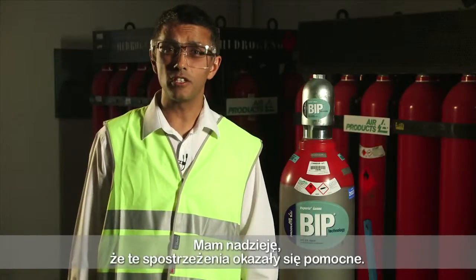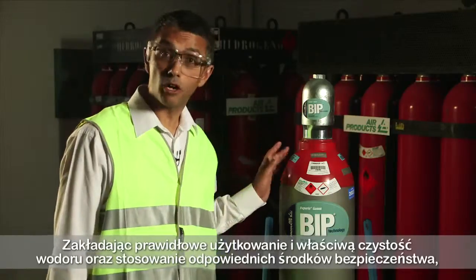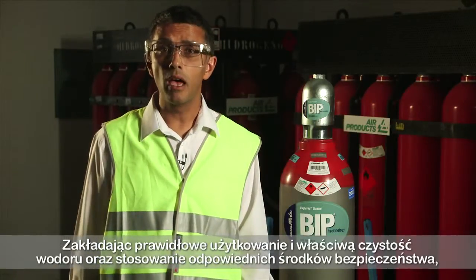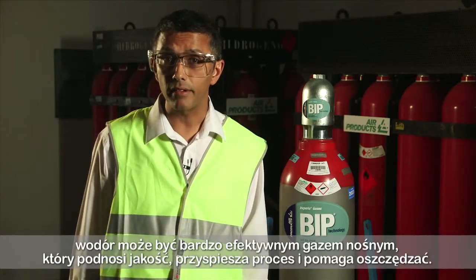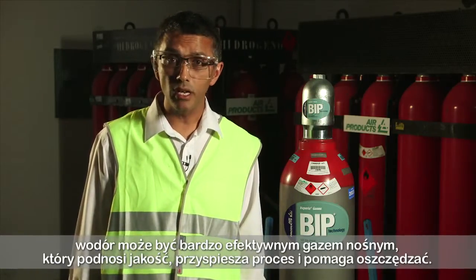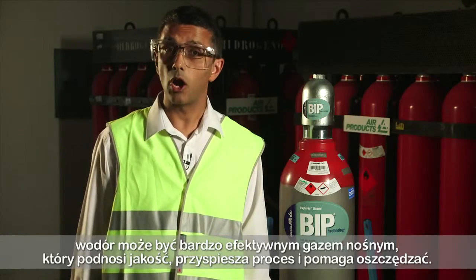I hope you found these insights useful. Assuming hydrogen is used at the right purity and the correct safety measures are taken, hydrogen can be a highly effective carrier gas that can improve quality, speed up your process, and help you save money.